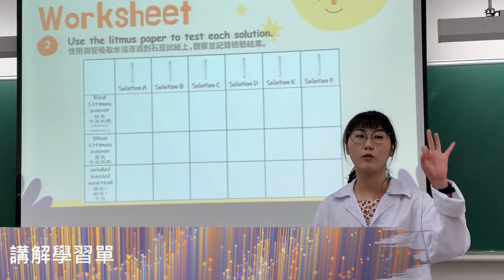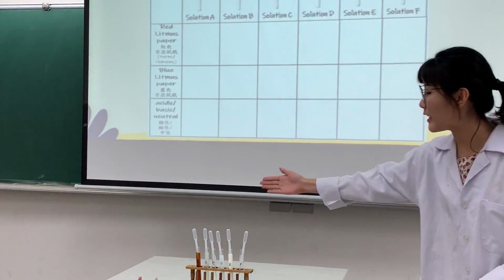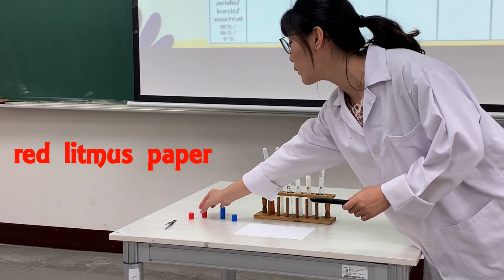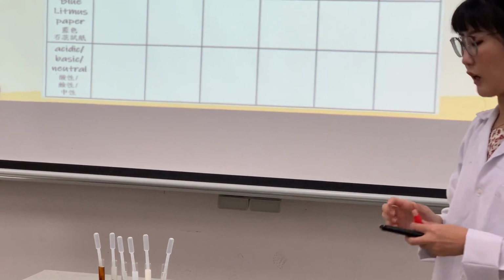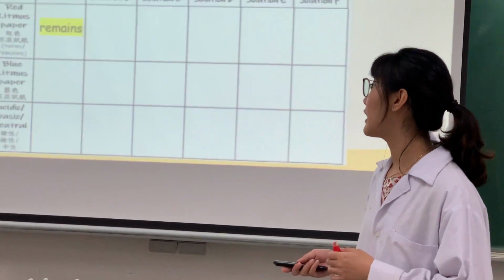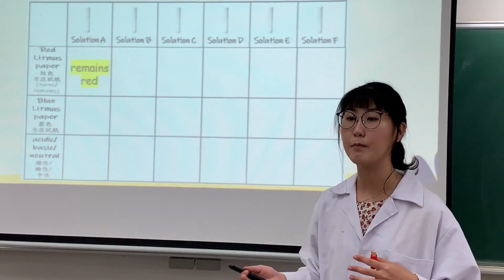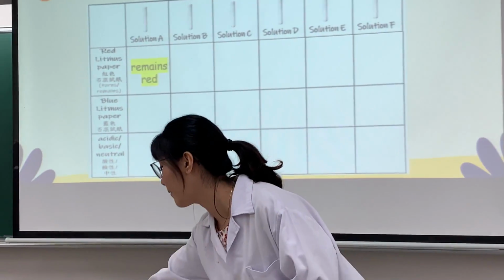Later, I want you to do 3 things. So I want you to use the litmus paper to test each solution. So the 3 things are, number 1, we will use the red litmus paper to test the solution. Okay, so I want you to write down the result. 希望你把结果写下来。So you can say it remains red, or you can say it turns blue. 所以你可以写 remains red 保持红色 or turns blue 变成蓝色。So that is number 1.